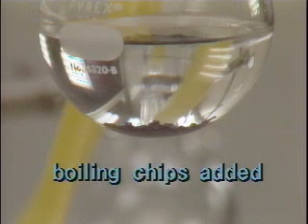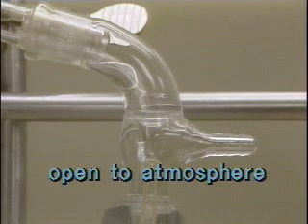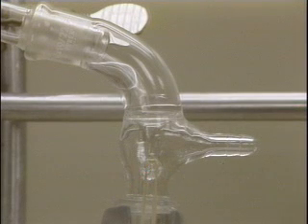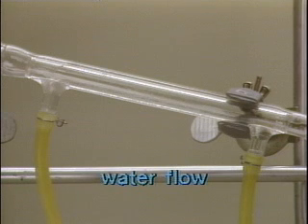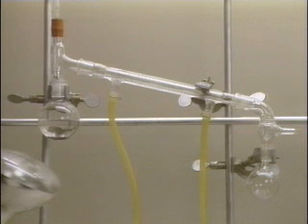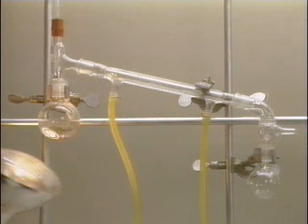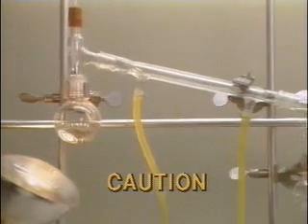Boiling chips have been placed in the flask. The adapter is open to the atmosphere so that pressure will not build up during the distillation. And finally, that the water is running through the condenser jacket. Once all of these items have been checked, the heat source can now be turned on. Because a distillation must be monitored, it should be continually watched and never left unattended.